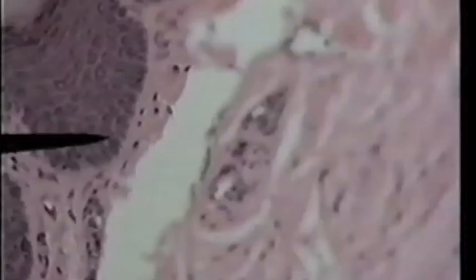The tip of the pointer is on the most superficial layer of living cells, or stratum granulosum of the epidermis. Next, we move to the stratum spinosum, the layer of cells in the region where the pointer is. Stratum spinosum, the fourth layer as you move deep in the epidermis. Now we have moved to the deepest layer of the epidermis, or the stratum basale. Stratum basale is one layer of cells.